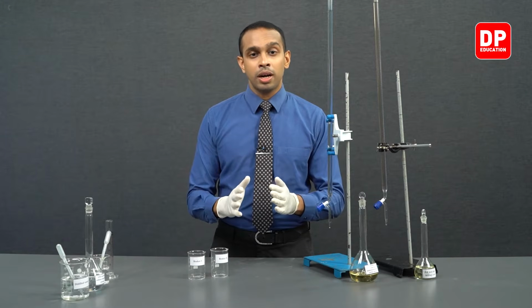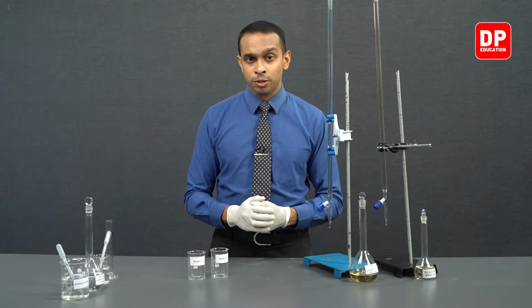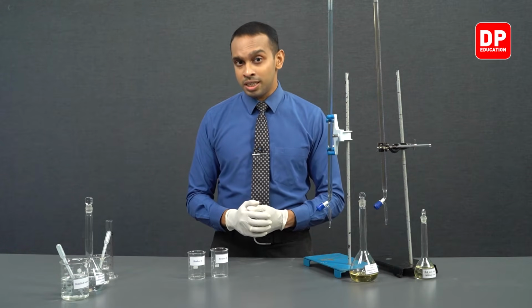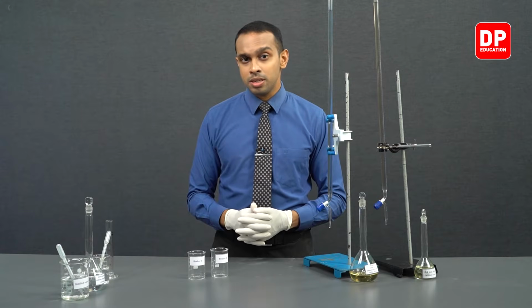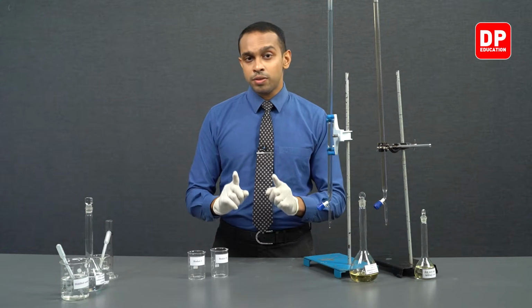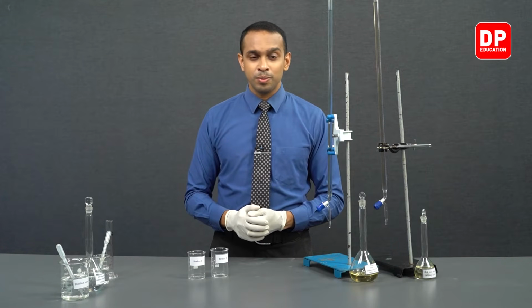We are going to start with a higher Fe3+ concentration, and we are going to carry out 5 different experiments where the Fe3+ ion concentration is gradually decreased. When we are carrying out these 5 experiments, we need a way to measure the rate of the reaction for each of these experiments.